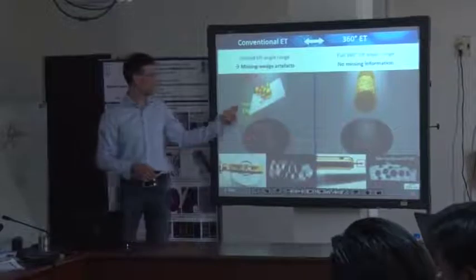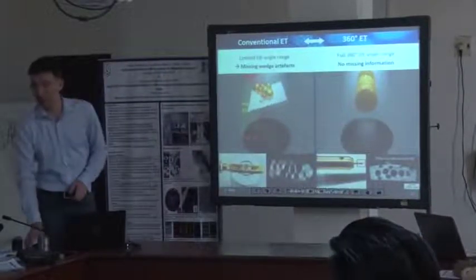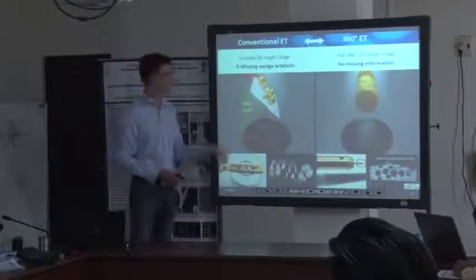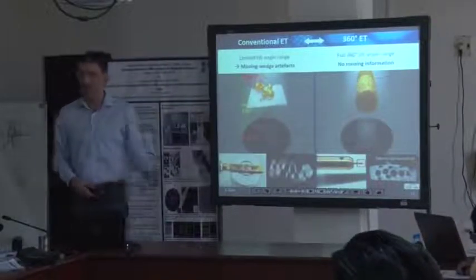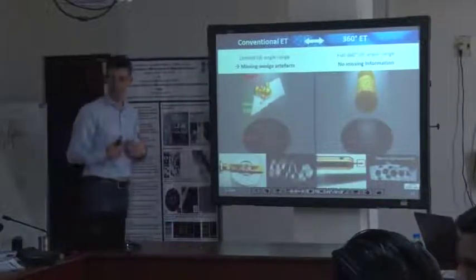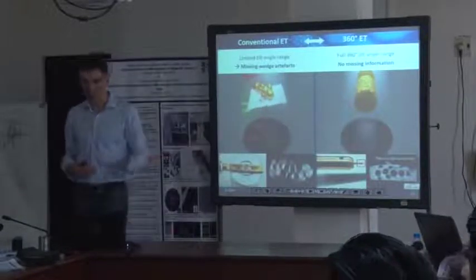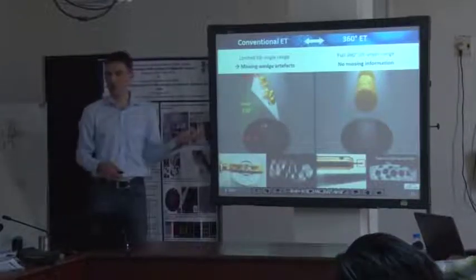And this is, for instance, just some 3D visualization of how electron tomography works. I mean, this looks pretty nice, doesn't it? So we have some TEM sample, and you see that it somehow tilts. This helps a lot. On the one hand, it helps me explain to you how electron tomography works, but on the other hand, it's quite attractive to present such images.